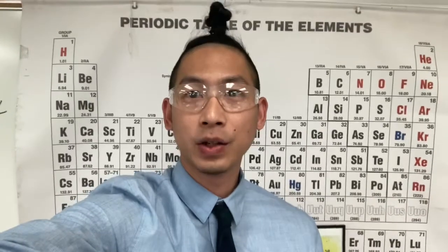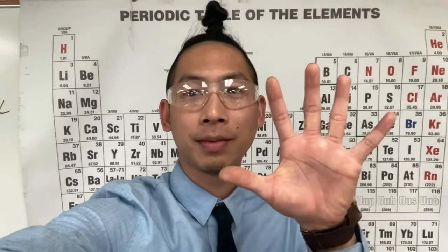Hey everyone, it's Mr. Hua, and today we are going to do the different types of reaction lab. I've got a total of 5 different chemical reactions that I'm going to show you, and it's up to you to balance those equations and figure out what type of reaction those are.